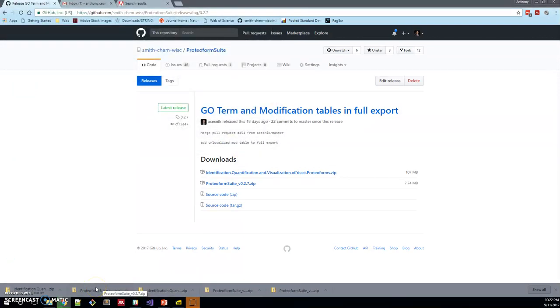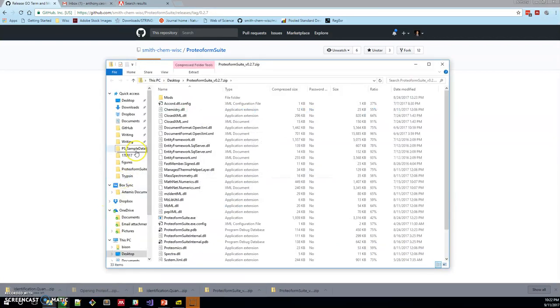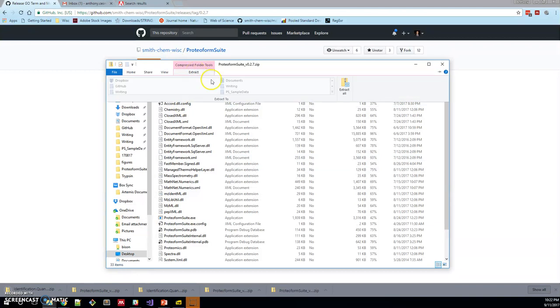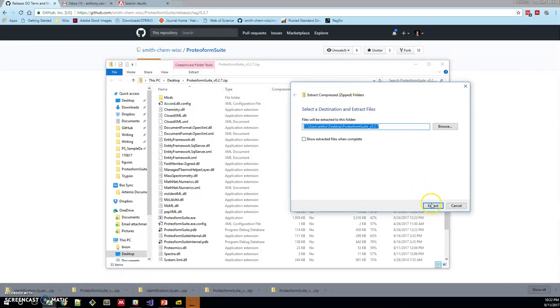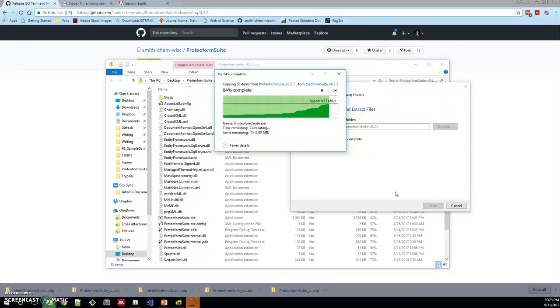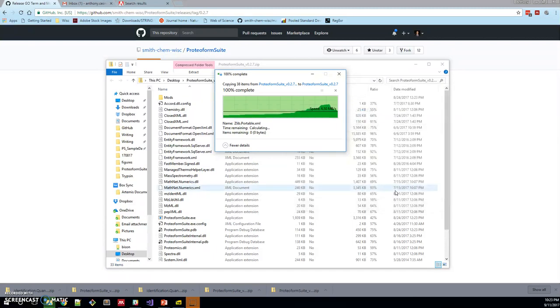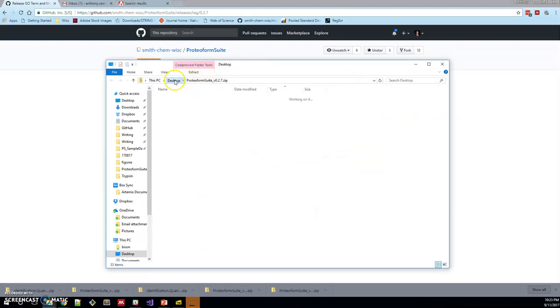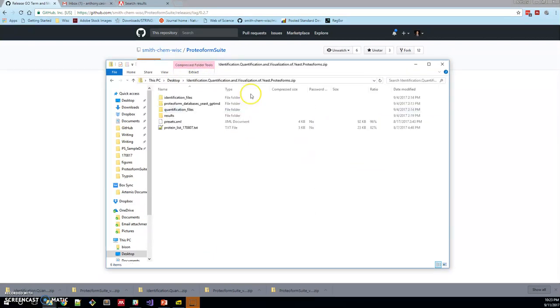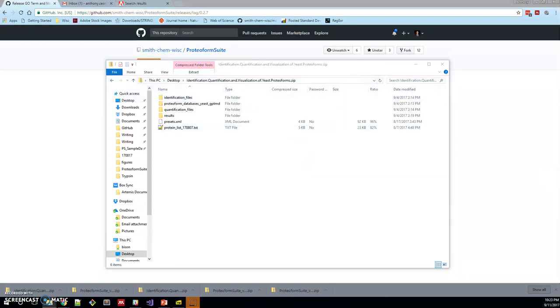So let's download this Proteoform Suite folder to the desktop and we'll also do the same for the vignette. Once we crack these open, you'll need to extract them. So extract all and you can just extract that quickly.